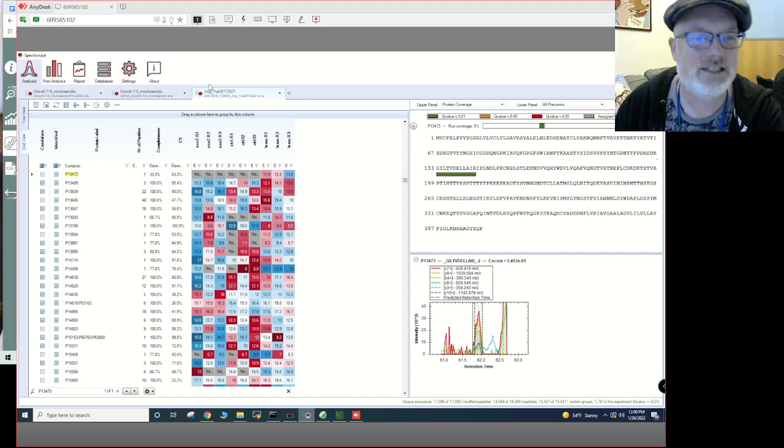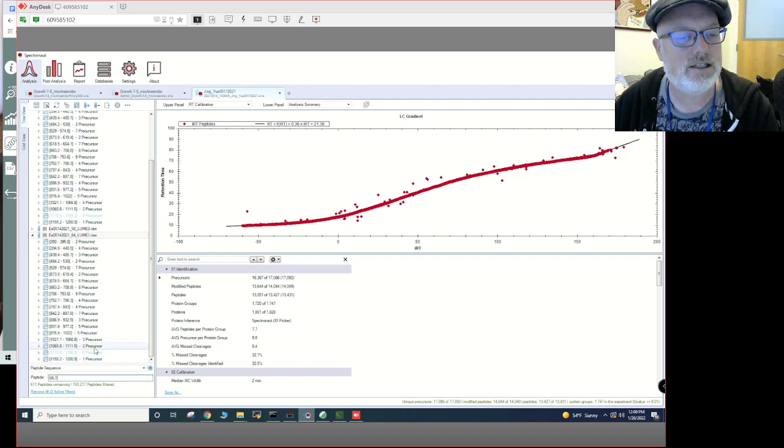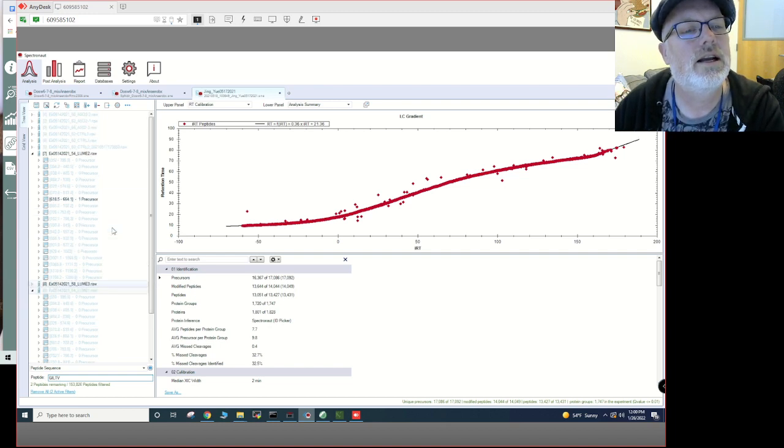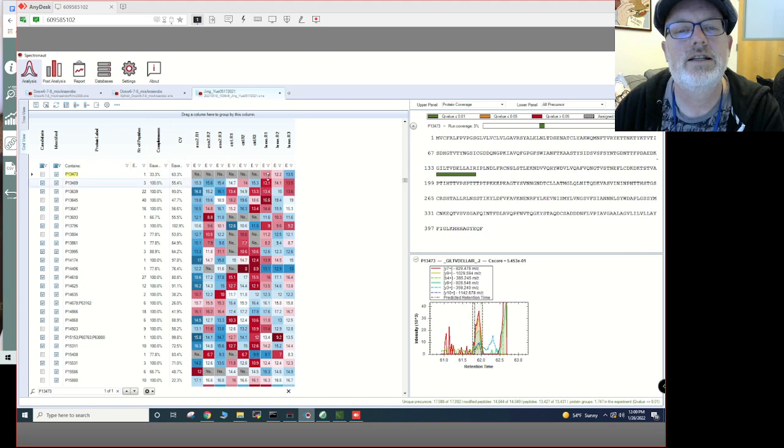GILTV. I spelled it wrong. Okay. So no, I didn't. GILTV. And why they're not showing up in this one? It's interesting. It is in here. GILTVD.